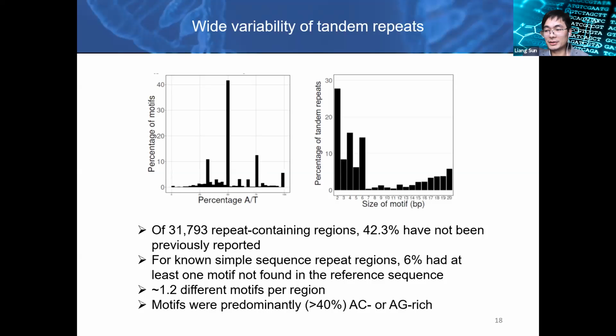Okay, got it. That makes sense. And the second question is whether this software can also detect zygosity? It cannot. There are quite a few limitations in this tool: we don't know the orientation, we don't know the zygosity, we don't know the precise number of units.